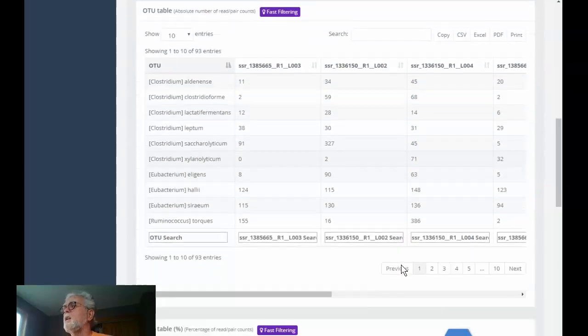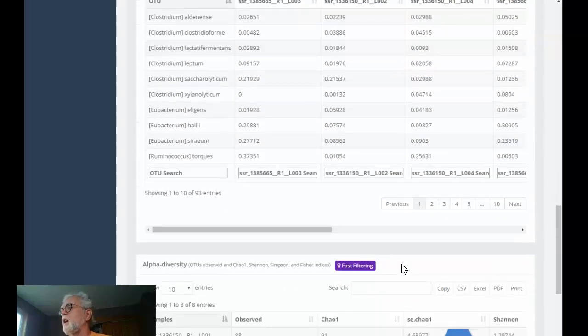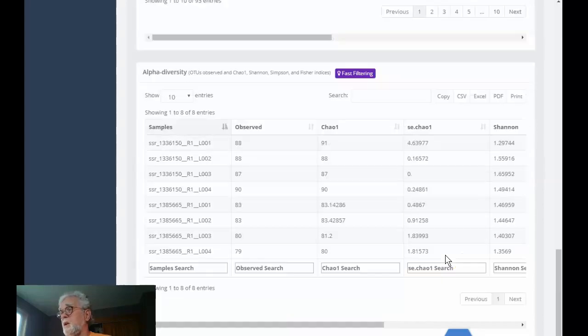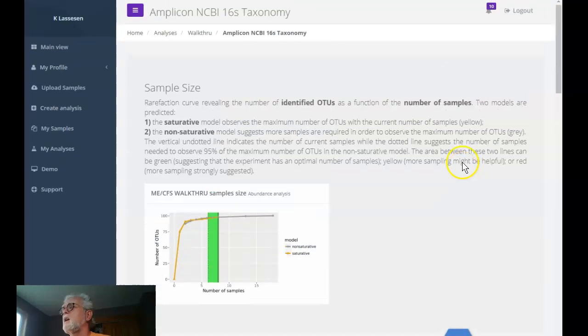So, and we have a number of reads. We have all sorts of technical information, which I am not about to go through and explain to you or attempt to explain to you. So we now have successfully processed through, managed to get the information processed, and we have our information ready.